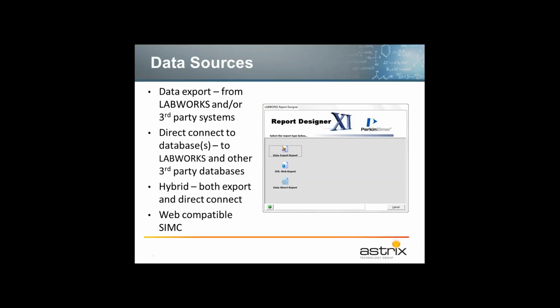This is one that requires a little bit more advanced skill sets. You're not really exporting it from LabWorks, but based on your knowledge of the LabWorks tables, whether you have Oracle or SQL Server, for example, you're querying those databases directly to pull data out that you need to report. Again, you can also direct connect to third-party databases as well.